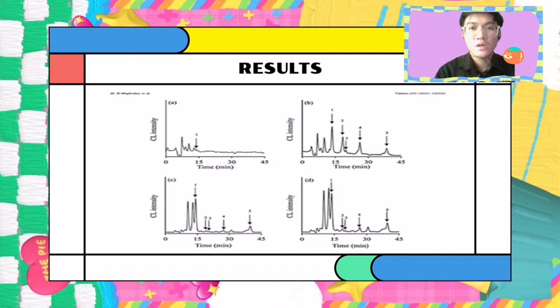The graph shows chromatograms of A, which is fresh canola oil, graph B, spiked canola oil injected in concentration of 5 micromolar, graph C, 10 minutes heated canola, and D, 30-minute heated canola, where peaks 1 to 5 are propanal, butanal, HNE, pentanal, and hexanal respectively, but only in graph A, propanal is present.